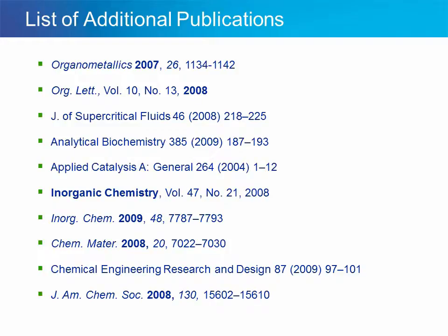Giving credit to my colleague Dominique Hebreau, he presented these references in Part 4 as recent papers published by academic researchers being worth reading, so I would like to post them again. If you are interested in keeping up to date yourself on how academic researchers are using ReactIR technology, just do a keyword search on ReactIR at the websites of scientific journal publishers. The ACS website shows that about 20 or so articles have been published in the first half of 2010 that cite ReactIR. With that, I would like to conclude this presentation.